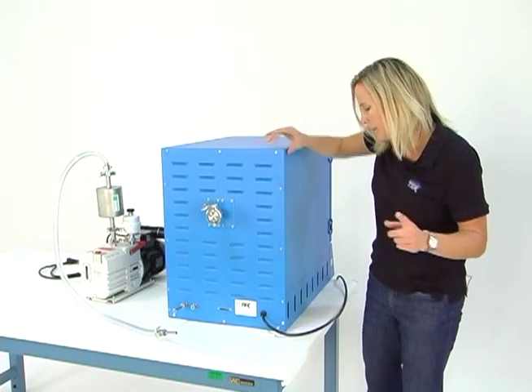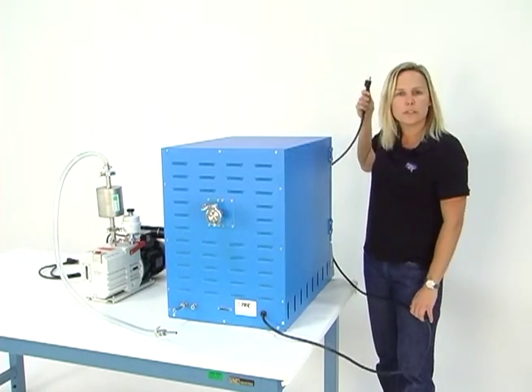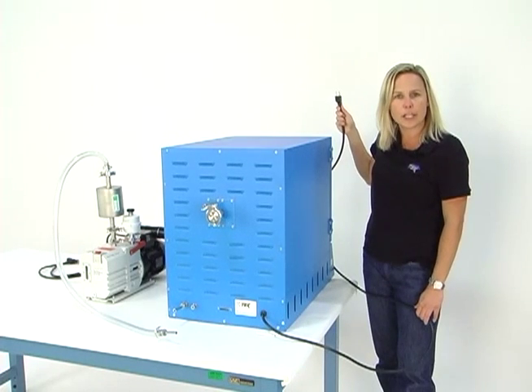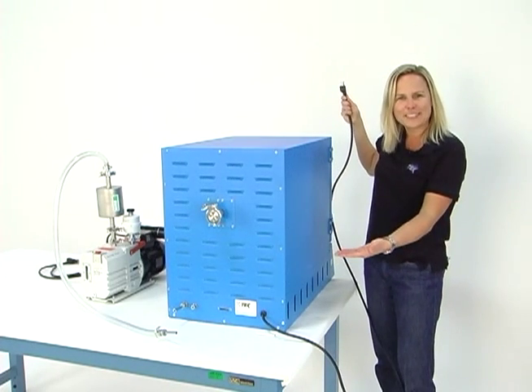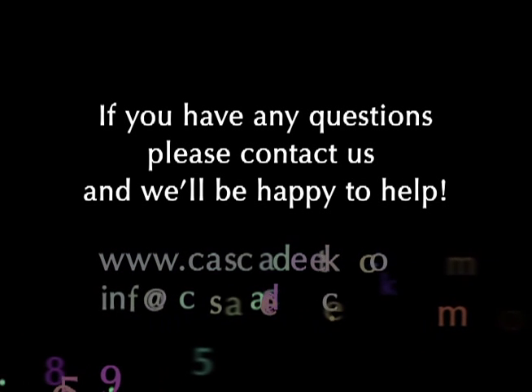That's a great feature to have. The TV-02 runs on 120 volt, 12 amps, so you can just plug and play and be ready to go. There's the back of your TV-02.